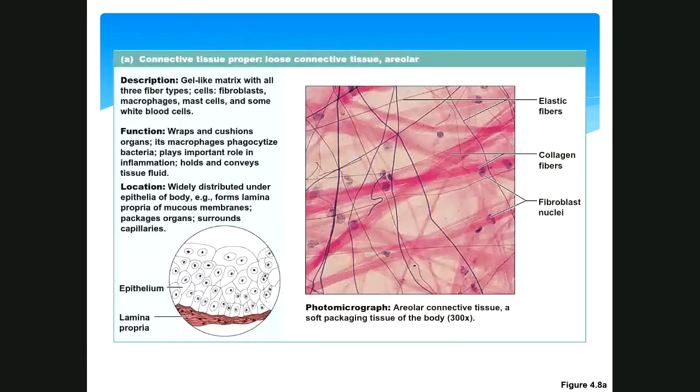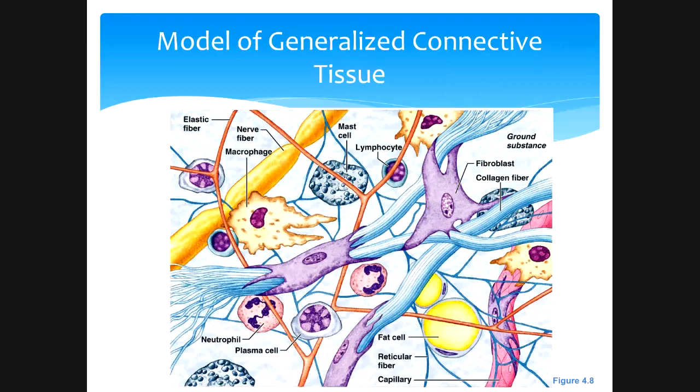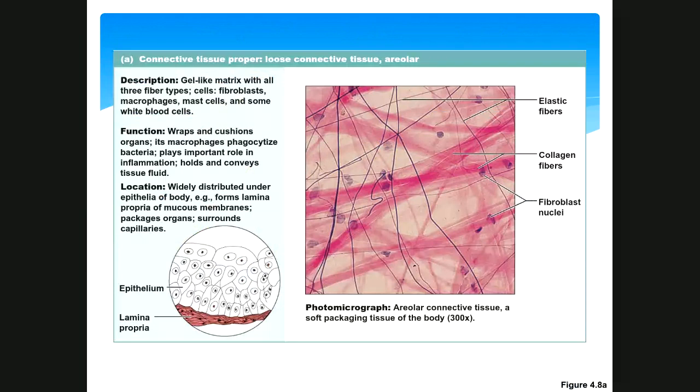And then we have a third fiber. And this third fiber is like this. It forms sort of a network, like a fish net inside tissue. And it's very, very faint. And they're hard to see because they're very diffuse. They're spread out like a net. Another way to think about them is think about a spider web. So if we look in here, these things that are very hard to see, they're skinny, really, really skinny and hard to see, like these over here.